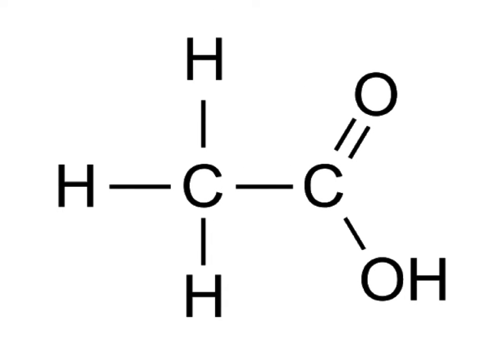The third solvent was a solution of acetic acid. You can see on the right hand side the carboxyl group. You can see that those bonds between the carbon and oxygen and the oxygen hydrogen, those are polar covalent bonds, and they contribute to the polarity of this molecule. So not quite as polar as water, but still a high degree of polarity nonetheless.